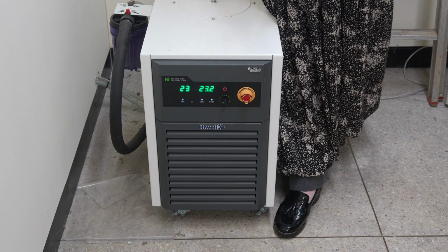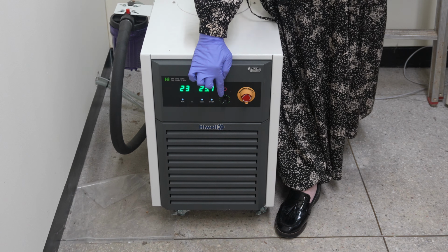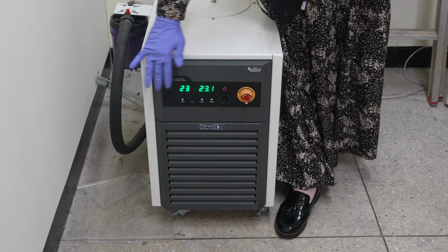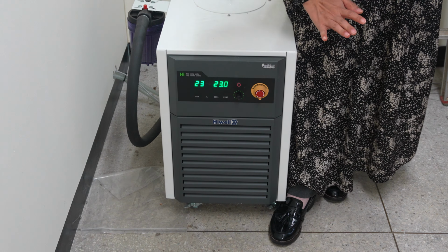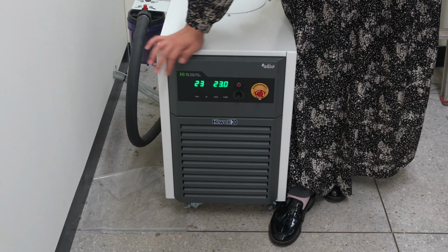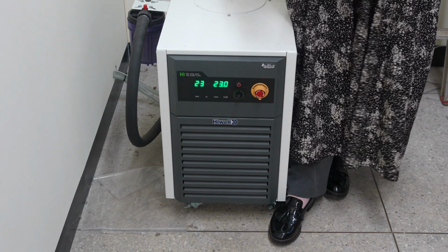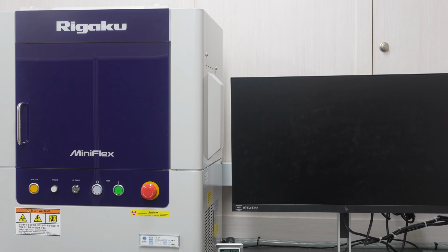As you can see here, it's showing 23.2 degrees Celsius. It's almost like room temperature. And we need only to press this power button to turn off all the light indicators here. Okay, now we are turning off, and you can see all the lights are off now, only showing the current temperature of the chiller, which is 23 degrees.